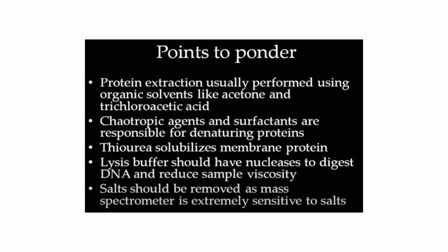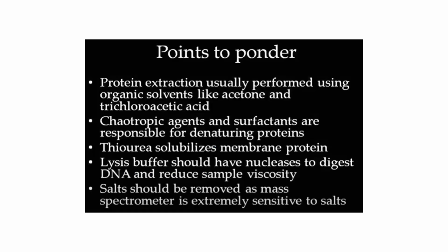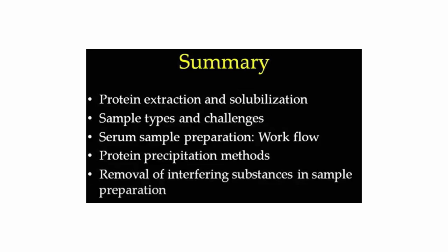Salts are such small molecules, and even those can be detected by mass spec. So all this needs to be considered very effectively, and cannot be neglected at all if you want to go towards mass spec analysis later and try to determine your protein. That's how strong mass spec is. So all these steps need to be followed much more thoroughly.